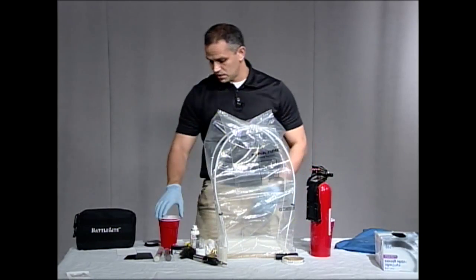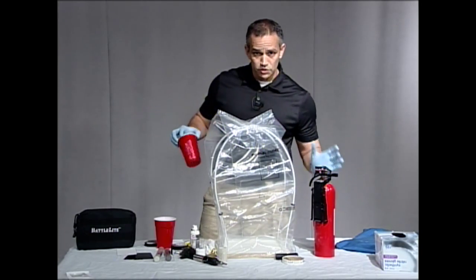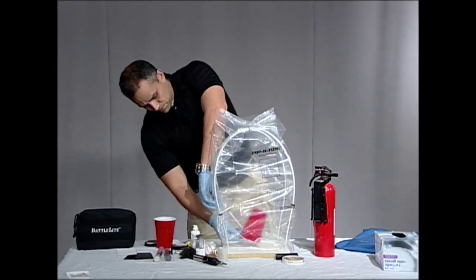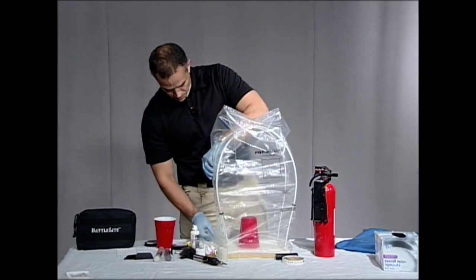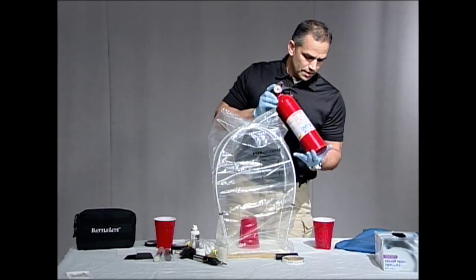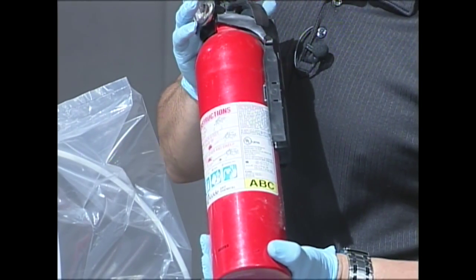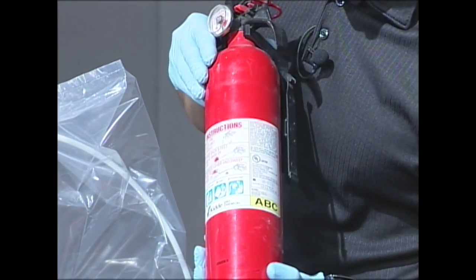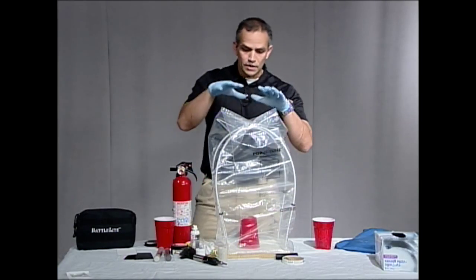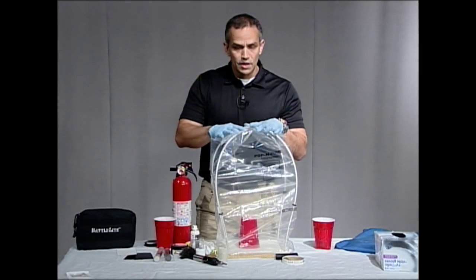I would normally use this with our cyanoacrylate fuming, but we're going to use it for developing with the powder. We have our cup — I'll put a new cup in here. Now this powder is going to be a white powder, so you're going to want to use this on a dark surface. I'm going to go ahead and put that in here. Now let me show you what kind of fire extinguisher I'm using — I'm using the ABC fire extinguisher, which can be used on all types of flames. Now that I have this cup in here, I would have fumed that first with our fuming wand or in a fuming chamber if possible.